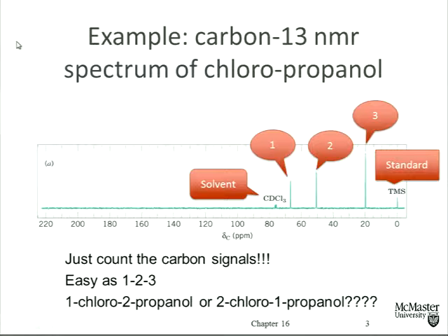The only thing you need to know is that, as in all spectra, as in infrared spectroscopy, this axis is in fact an energy axis. So it's an energy axis, even though it's in units that don't look like it. But it is in units that give us quite nice numbers, numbers from 0 to 200, right? We don't have powers of 10 or whatever involved in this axis. It's been carefully selected to give us numbers that are easily handled. So along the x-axis, we have energy, and different carbon nuclei in the molecule absorb at different energies.